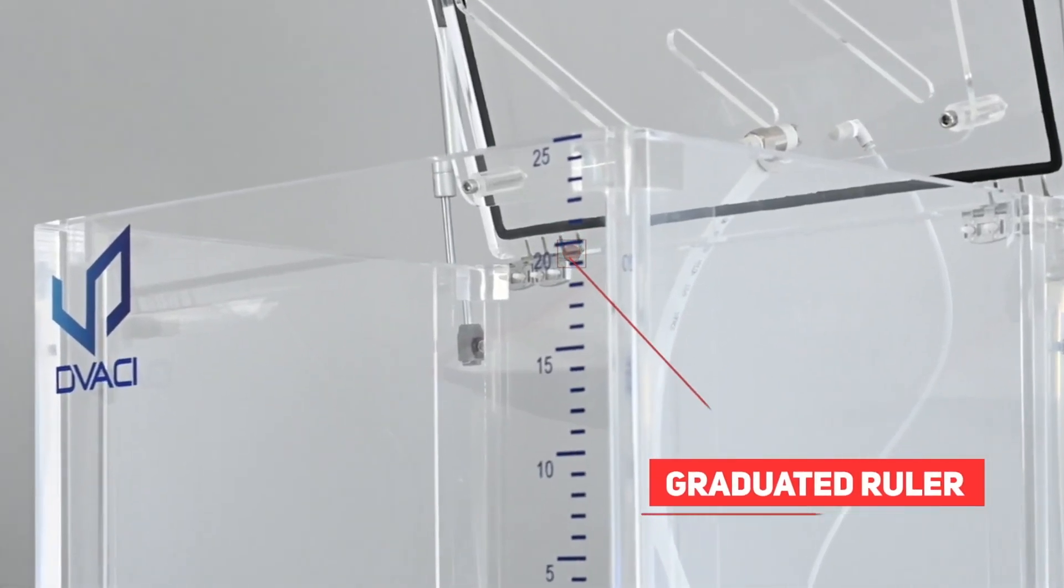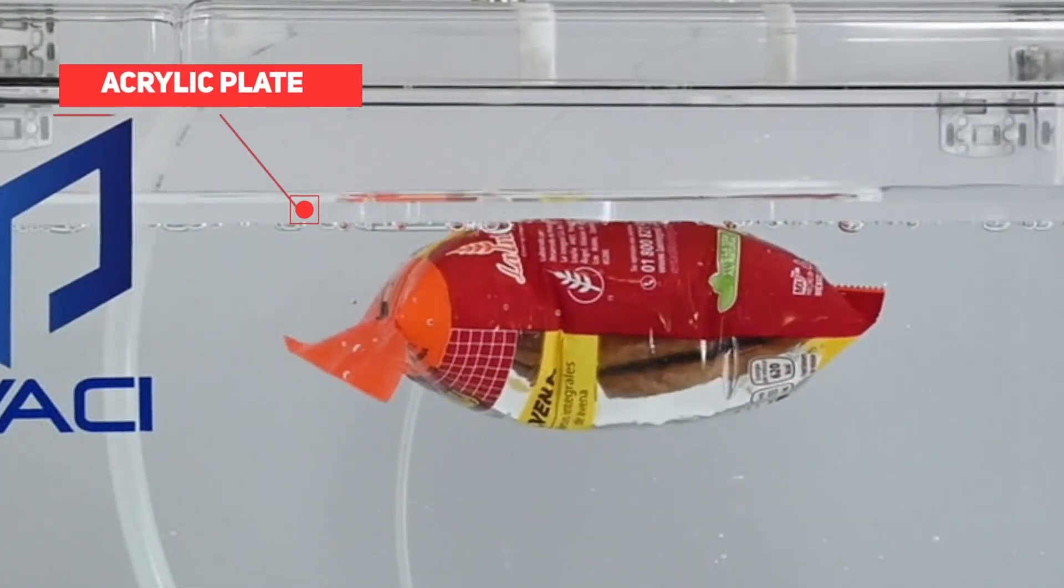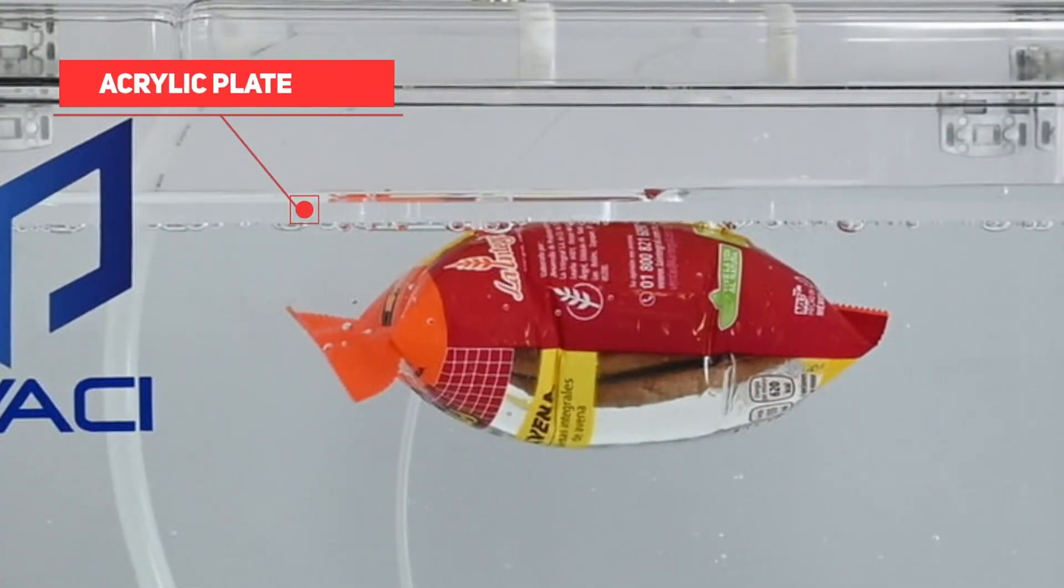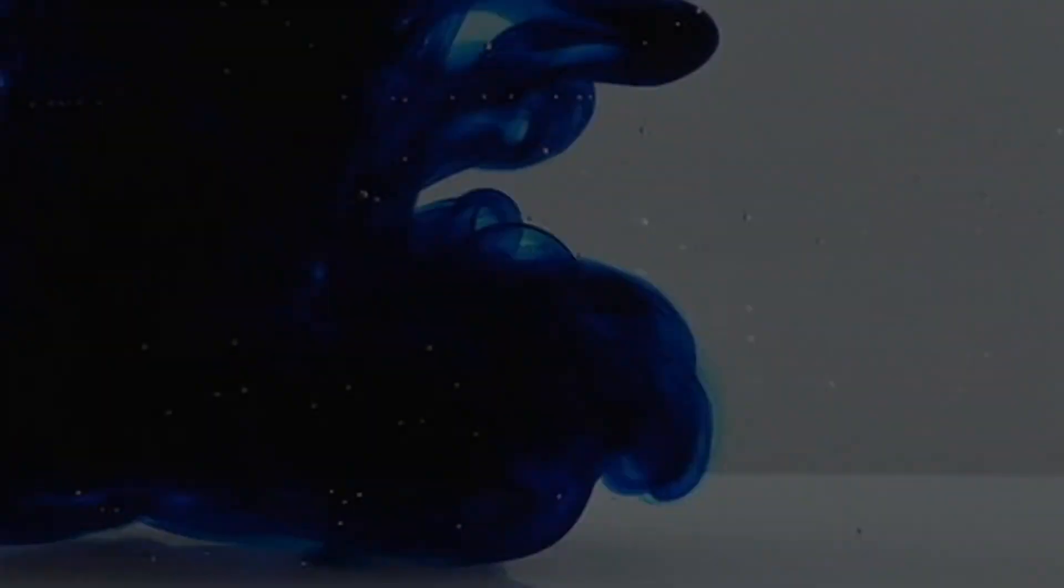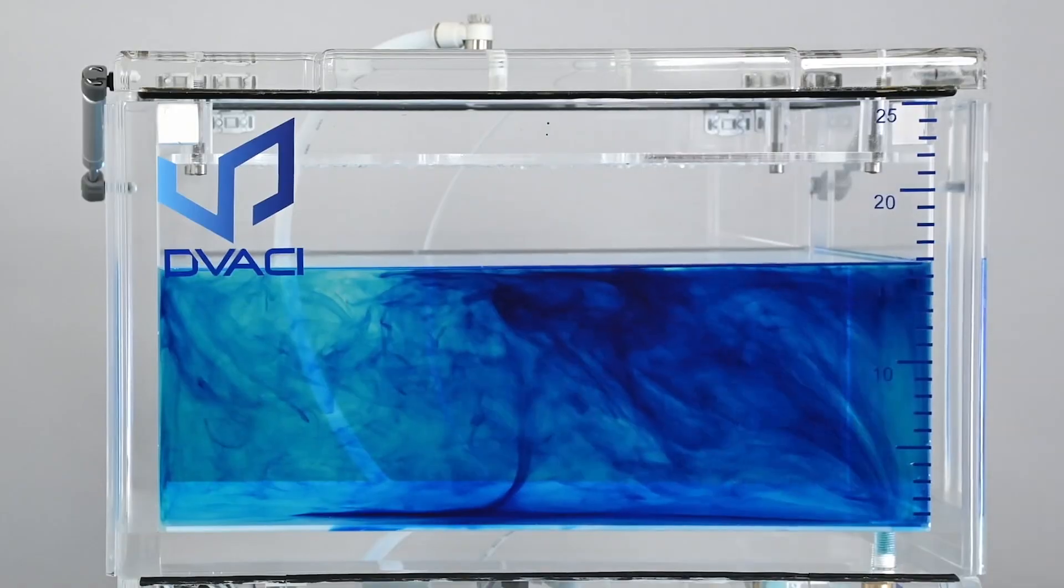A ruler graduated in centimeters helps determine the level of liquid during immersion testing. The inner grid keeps the packaging under water. Its draining system enables purging liquid from the vacuum chamber, avoiding splashing and staining the operator.